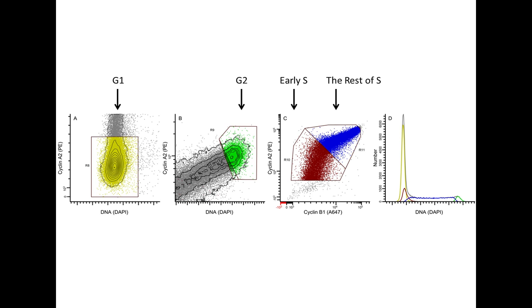The next steps are to isolate G1 proper, that is minus early G1. Both G1 and G2 can be segmented using cyclin A2 versus DNA plots with M cells removed by Boolean logic. The remaining cells are in S. The critical G1S and G2 boundaries can be checked by comparing the G1S and G2 phase fractions of the DNA distribution determined by Gaussian modeling of DNA content with programs such as ModFit to the frequencies of cells determined by color coding logic.